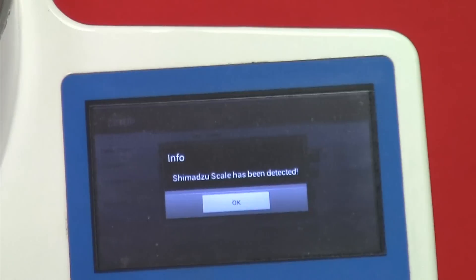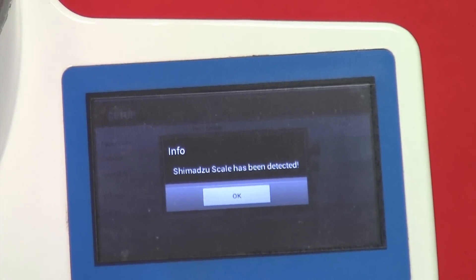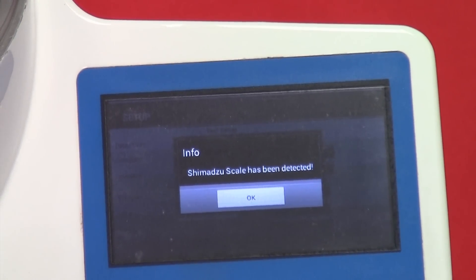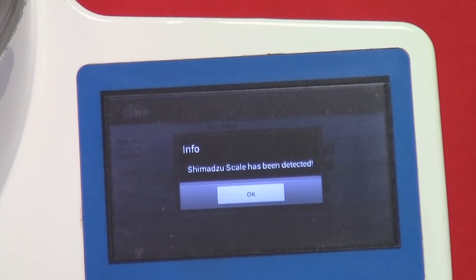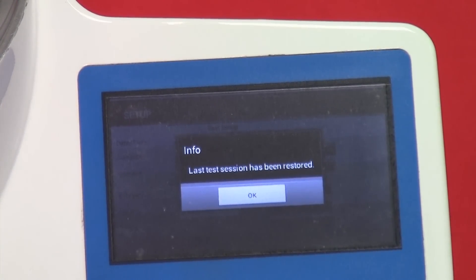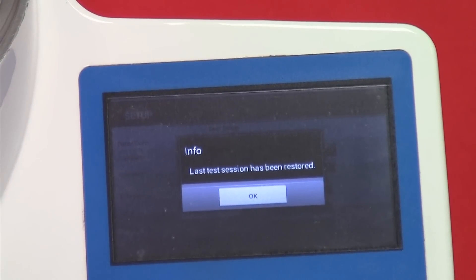Once the software is uploaded, two windows will appear. The first is an info window stating that the scale has been detected by the Airjet Sieve. Press OK to proceed. The next window is another info window stating that the last test session has been restored. Again, press OK to proceed.